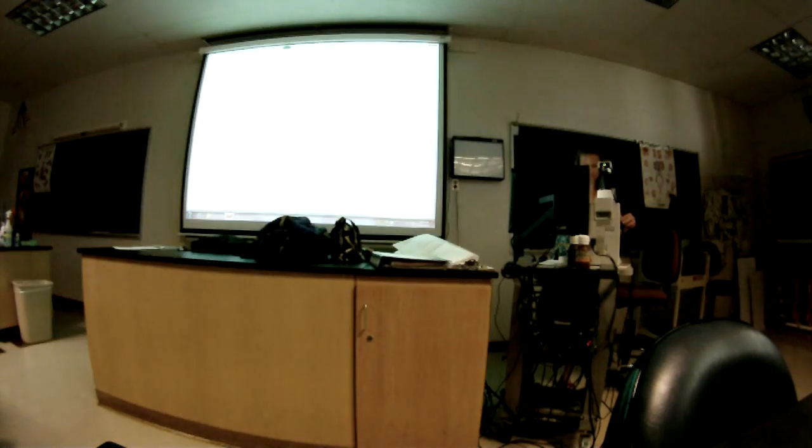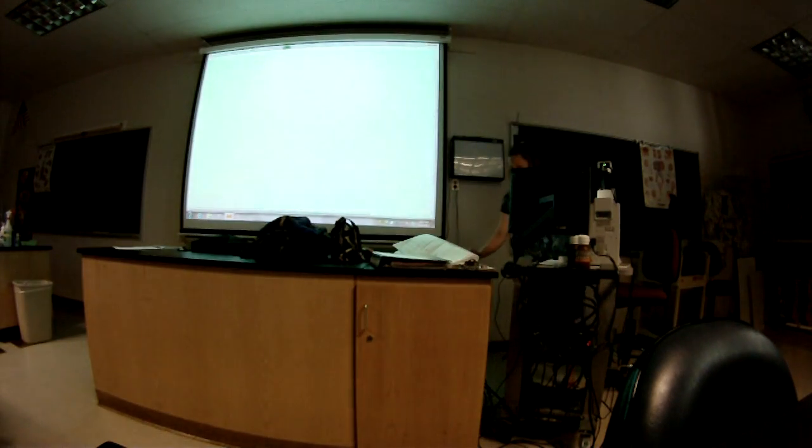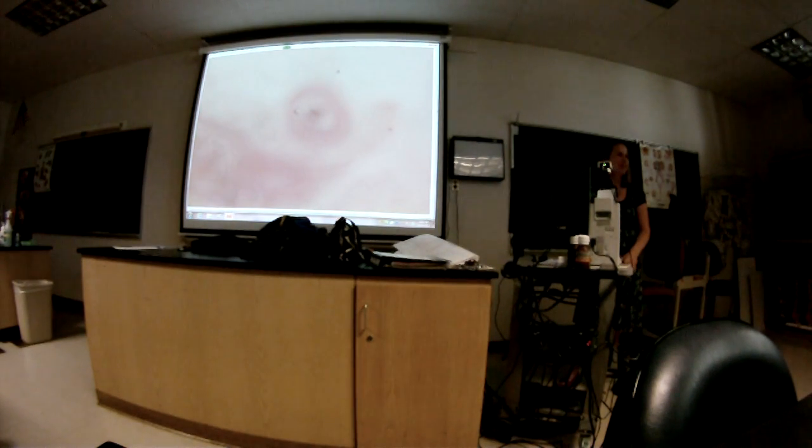Okay. Tubule. Convoluted doesn't have to be in it. Yes, convoluted has to be in it. How little of an answer can we get away with? I know. Why don't I just put 2? Why don't I just leave it blank? How about that?